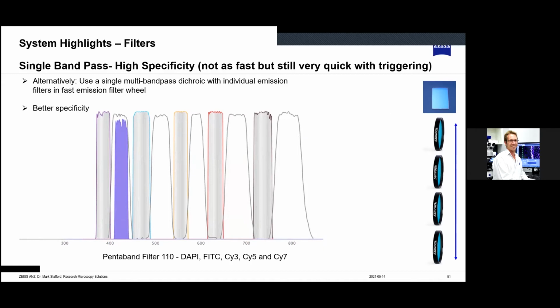Yeah. So say you have an experiment with 3 colors, low signal, but you don't care about time. What would you recommend? I'd probably, if you don't get crosstalk, I would just use the multis. So think about the separation. That's the critical thing. Similar to, if anyone here is big on deconvolution, where we call them faster.